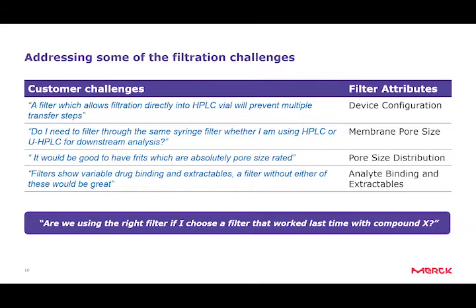So the bottom line question was, are we using the right filter if I choose a filter that worked last time with compound X, which is a very common practice in the labs?